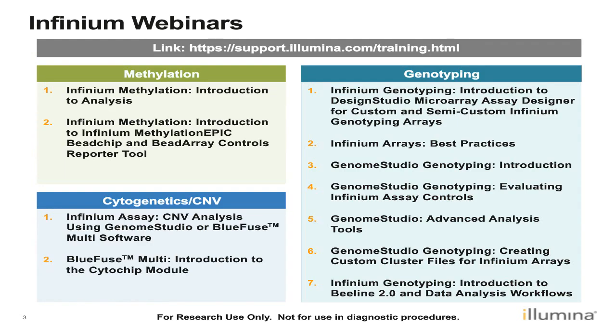And before I get started with the GenomeStudio webinar, I'd just like to show you this reference slide showing all the various Infinium webinars that we have available on our training website. As you can see, we have a couple of methylation-focused webinars and a couple of cytogenetics and CNV analysis webinars. And we also have several webinars that cover genotyping. So if you'd like to learn more about these other topics, go ahead and go to that webpage and watch those other webinars.